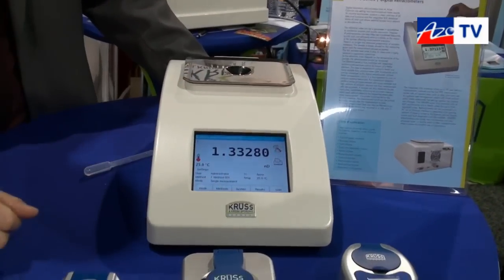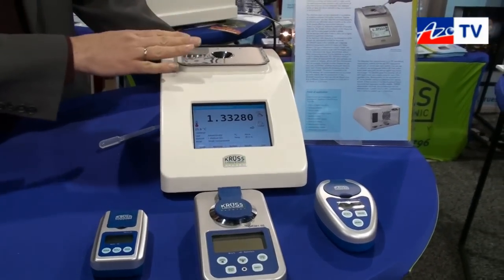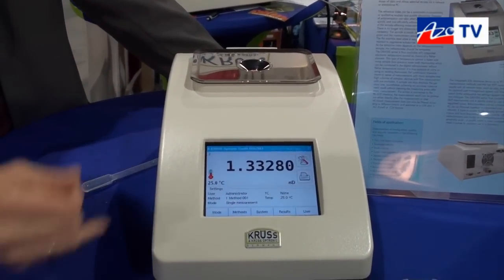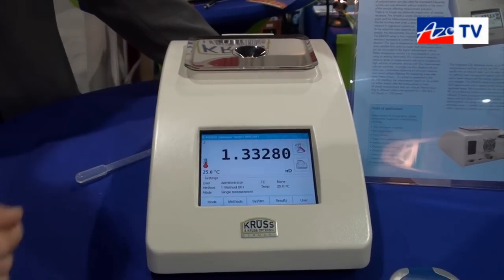It's part of our refractometer range. We also have small handheld refractometers. The benchtop model DR6000 is available in different accuracies — with five digits in the refractive index or four digits also.